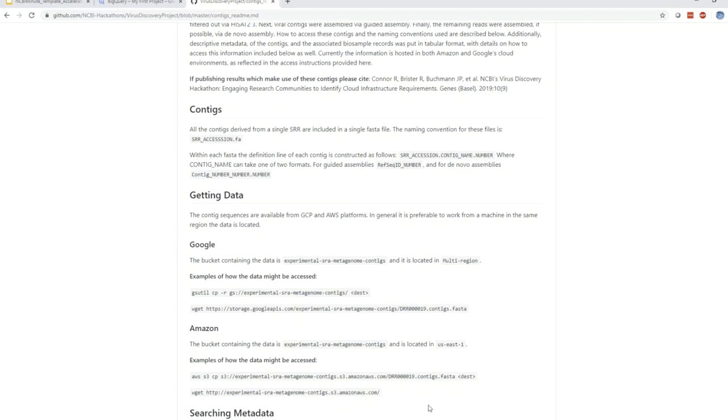Okay, that's great. I don't see any more questions. I think we're just about done. Oh, wait, somebody says they have one more in just a second. Okay, let's see what this one is. So this is an interesting one. We might not be able to address this directly, but this is about the data from GISAID, and how does that data get reflected in SRA? This is particularly relevant for the coronavirus data. Right. Unfortunately, I don't believe we have that data available at SRA. We are certainly exploring options on how to get access to that data, so it would be publicly available.